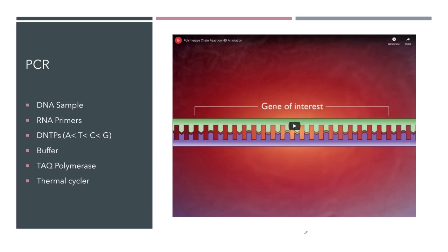Right now, the gold standard in testing is a PCR test. And PCR is used to detect specific DNA sequences, so it's used quite extensively in diagnostics. Its real purpose is to make lots and lots of copies of a gene. We want enough copies of genes so that we can manipulate it or see it or use it in research or detect its presence. And it is so sensitive and so accurate that it's the perfect type of test for diagnostics.